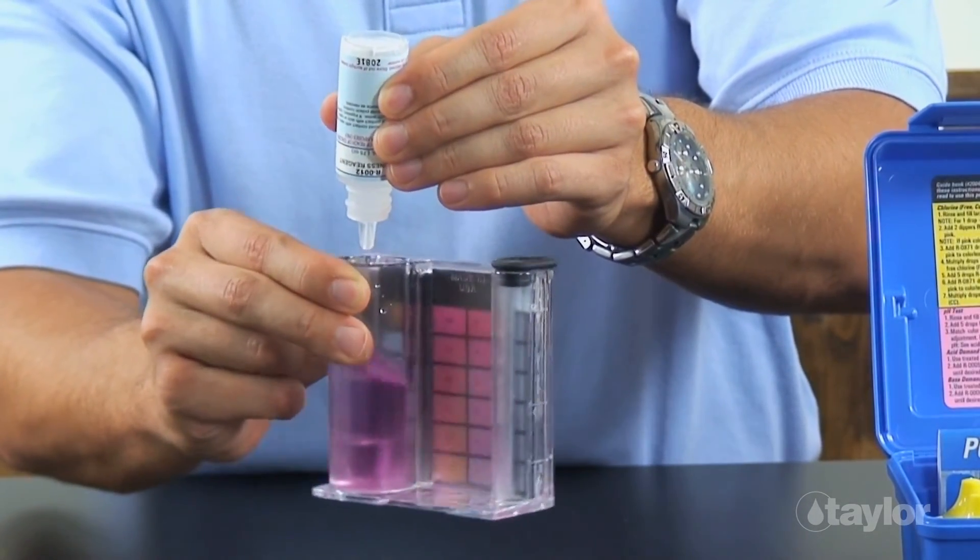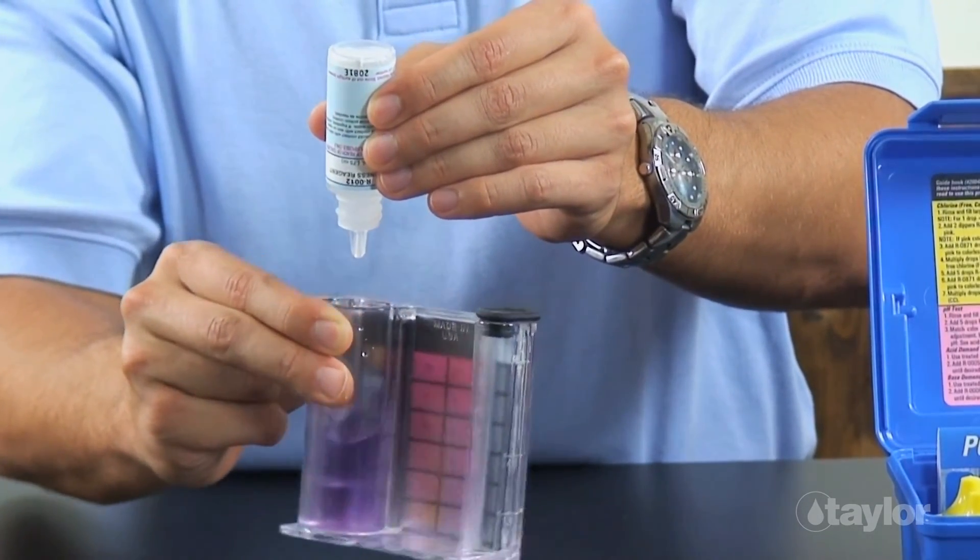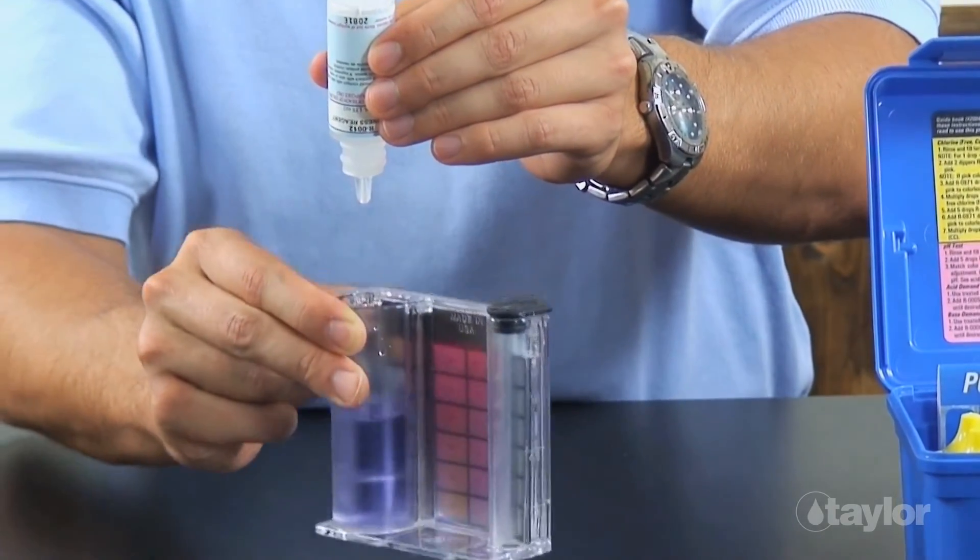Add the number of drops used in this step to the number of drops reagent 12 used at the beginning of the test, then multiply the result by 10. Record the result as parts per million calcium carbonate.